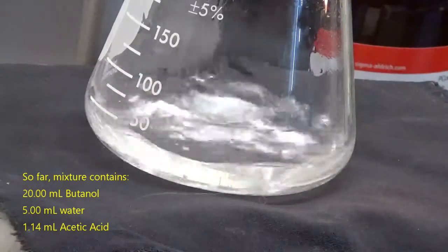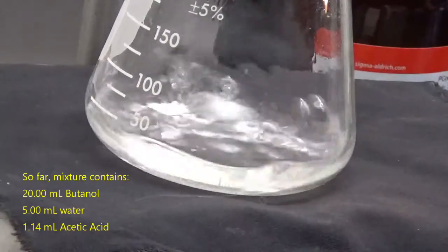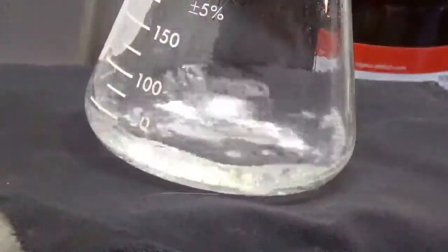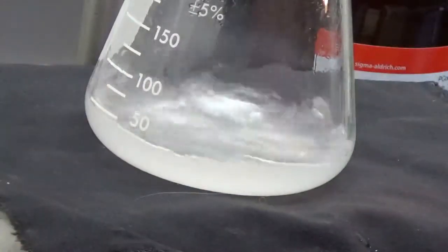So our first turbid point just happened, and now we're going to get turbid again. How? I'm going to add 5 milliliters. Sorry, I'm going to add 5 more. That's a really shoddy construction. I'm going to add 5 more milliliters of water, and that's going to put us back in the two-phase region. Right in here. I lost a drop, but nobody's perfect. And you could see it clouding right up again.